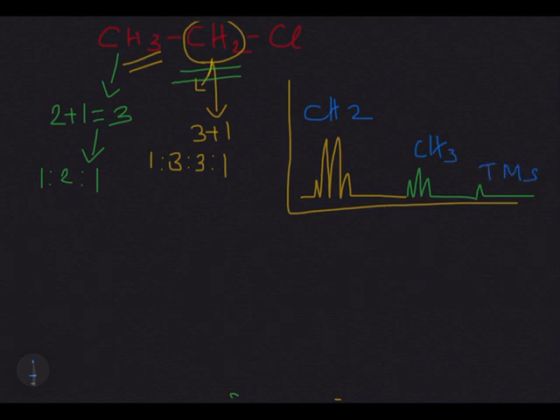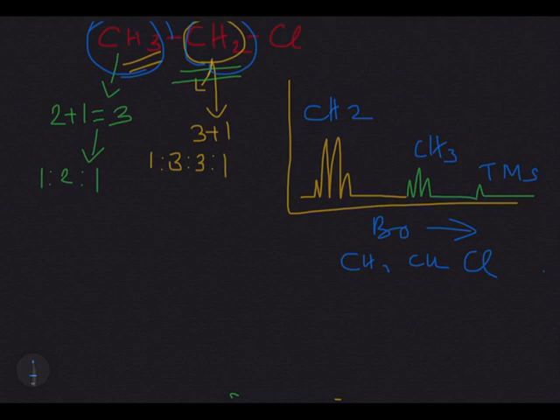This is the NMR spectrum of the compound CH3, CH2, Cl based on spin-spin splitting. Thus a signal can be split into multiplets because of what reason? Here there is a magnetic field generated by these CH3 protons. A magnetic field can be generated by the CH2 protons also. These magnetic moments interact with the magnetic field of the external radio frequency radiation, and that causes splitting of the signal into multiplets. So let's see another example.